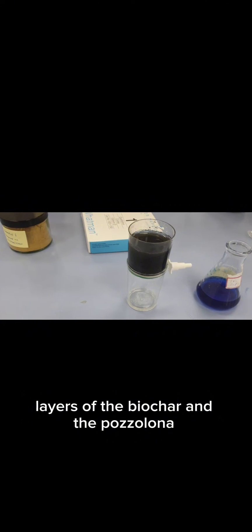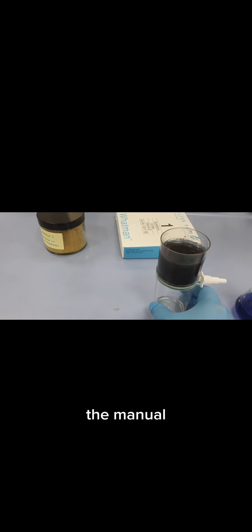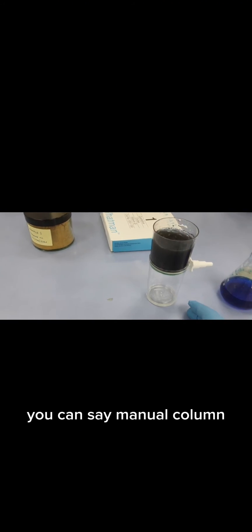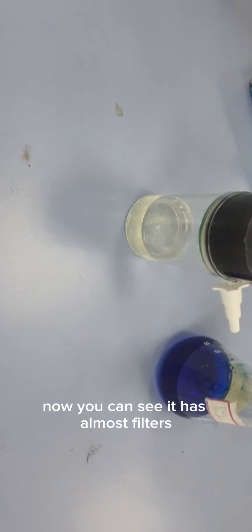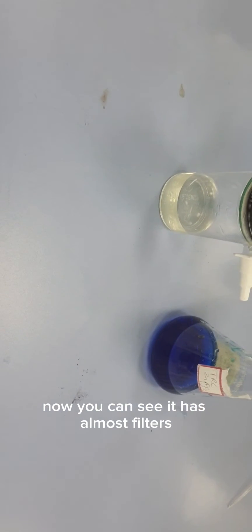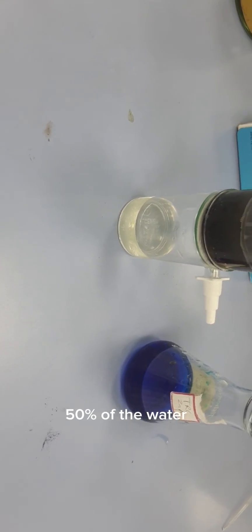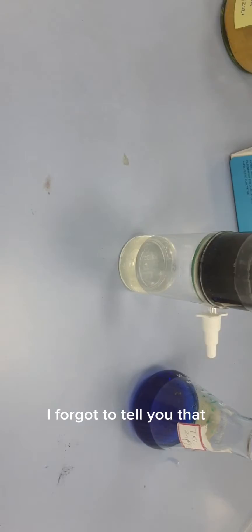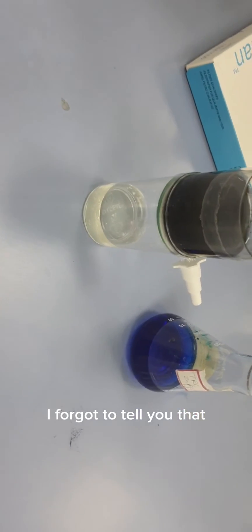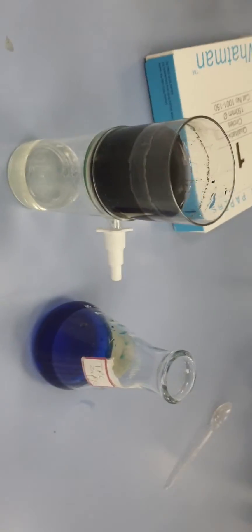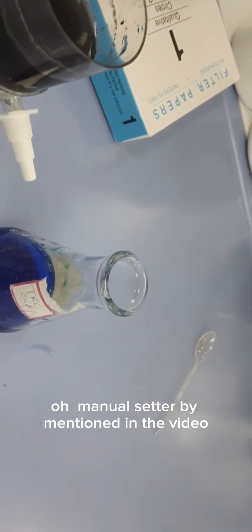This is the manual column. Now you can see it has almost filtered 50 percent of the water.